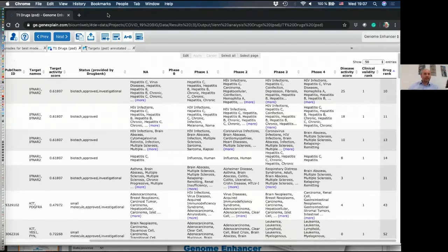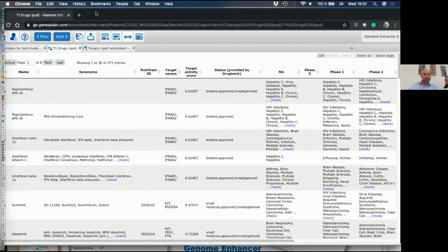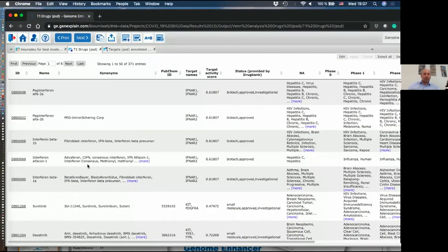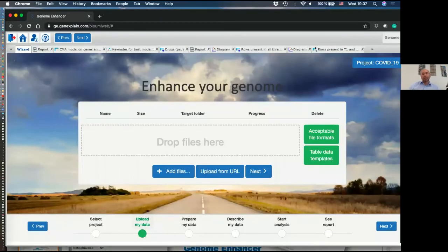Next question: can the blood plasma proteome be integrated into the pipeline? Yes, very good question. In fact, in this paper which we're analyzing data from, they did not only lavage, but they also did RNA-seq, not from plasma, but from PBMCs, so from cells, macrophages, which were filtered out from the blood.